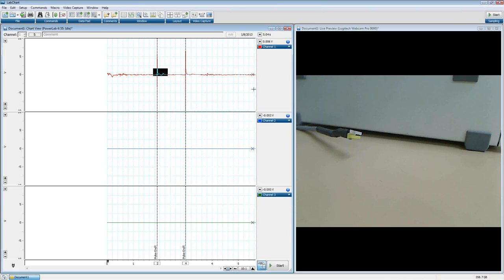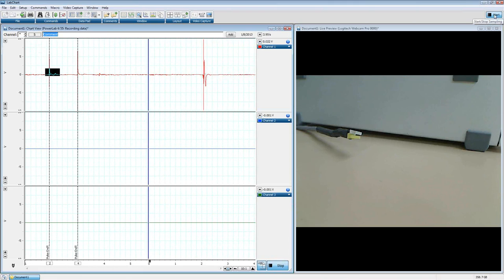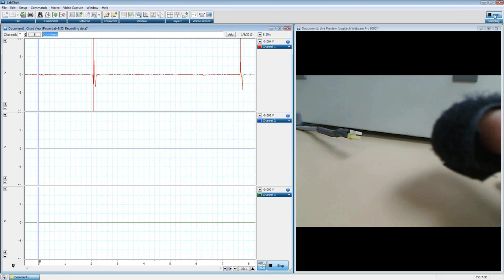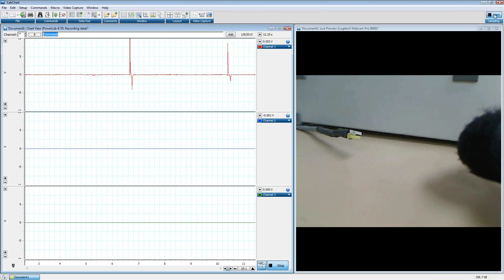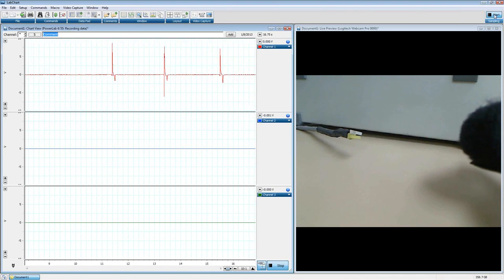Hit OK. And you'll see, turn it on, be very fast. We get our flashing light there. So go ahead and watch my recording there. Tap. Oops, let's try not to tap. We get our little LED light there. Like I said, very, very fast.